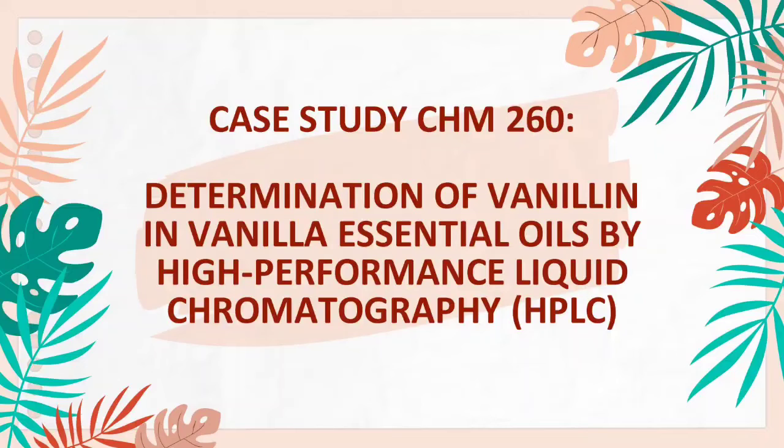Hi, Assalamualaikum. For today's video, we are going to present about determination of vanillin in vanilla essential oil by High-Performance Liquid Chromatography, HPLC, for case study CHM 260.